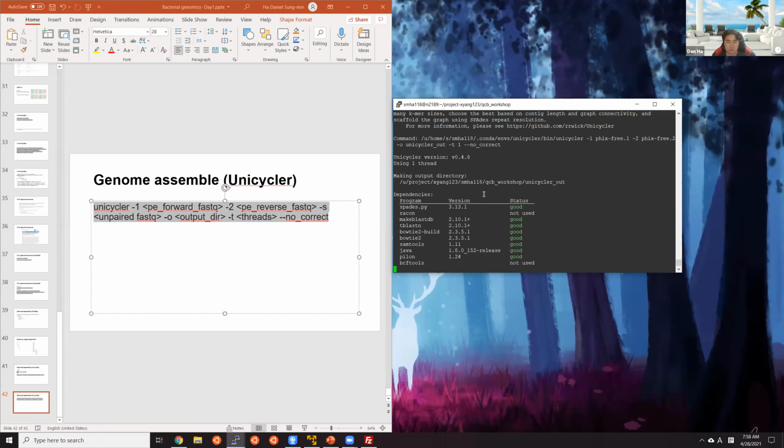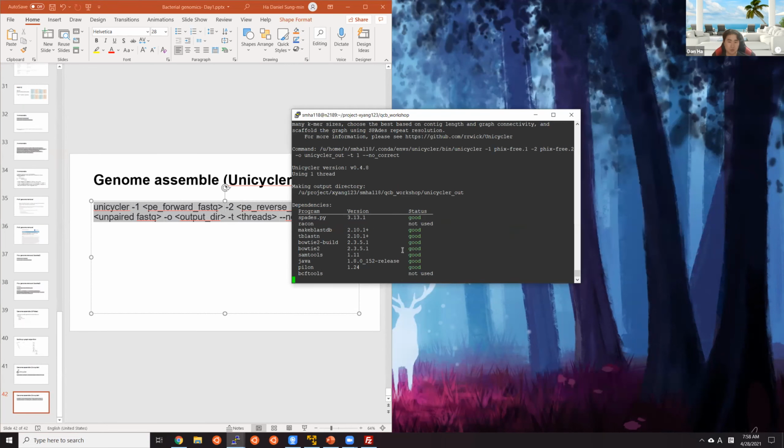So I guess this is it for today's workshop. For tomorrow, I hope you guys have these assembly files ready. So keep them running until it finishes. And yeah, that's it for today.